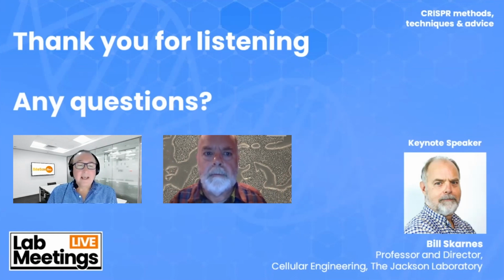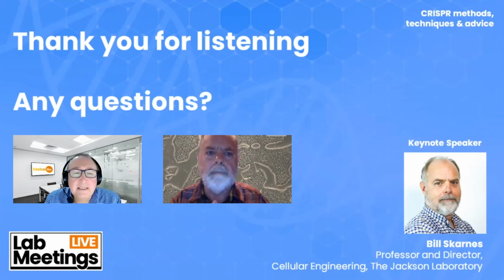Okay, great, thanks. And we have a question from Anthony Adamson, who is one of the keynote speakers. He asked, do you routinely use asymmetric ssODN donors? Yeah, we do. We compared asymmetric donors with symmetric donors, and we varied the length of the donor and so on.